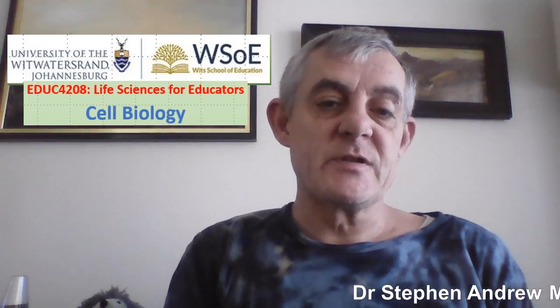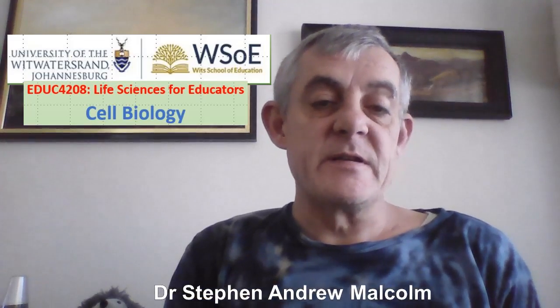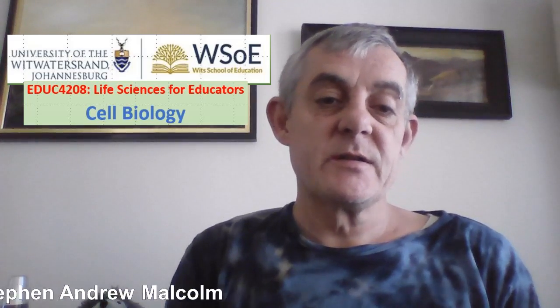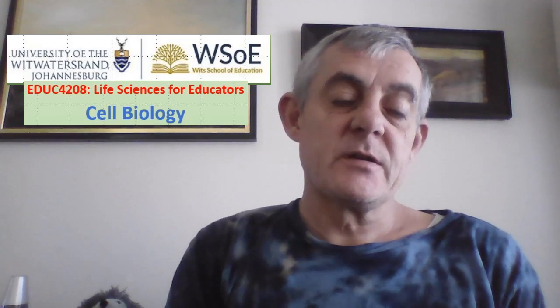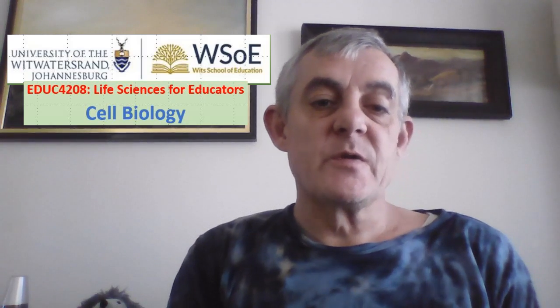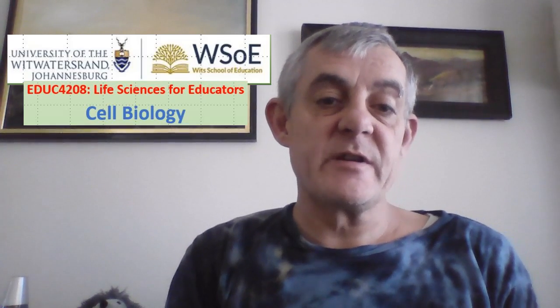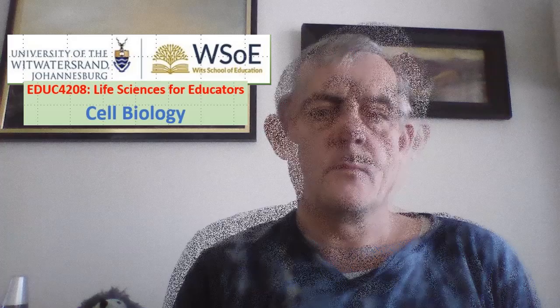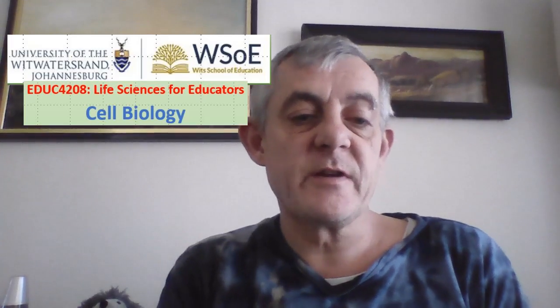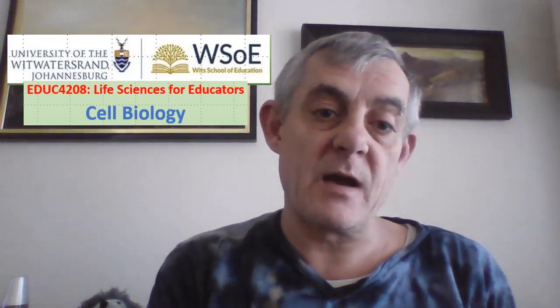Welcome back to the Honor Students for these video support sessions for the course Life Science for Educators. Yesterday's session looked at microscopy, so this next series of videos is just to provide additional support on this topic. In this first video, we are going to look at the light microscope.